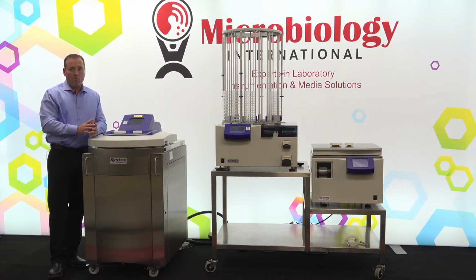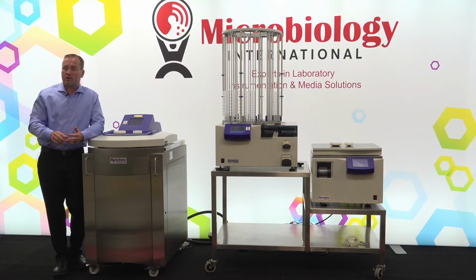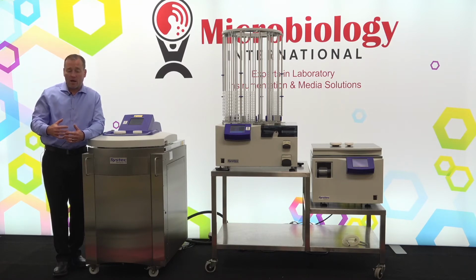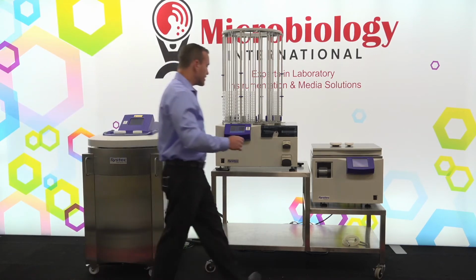So I think at this point we would like to go into the other mechanism for the plate pouring device, which is the tube filling option. So the tube filling option is quite useful, and the MediaFill offers us really a multifaceted instrument that allows us to do 35 millimeter, 60 millimeter, 100 millimeter plates, as well as deep dish plates, and can also be changed over into a tube filling device. So with one instrument, we do really have a lot of facility to offer a lot of labor-saving type applications for your laboratory. So we'll just change this out real quickly.